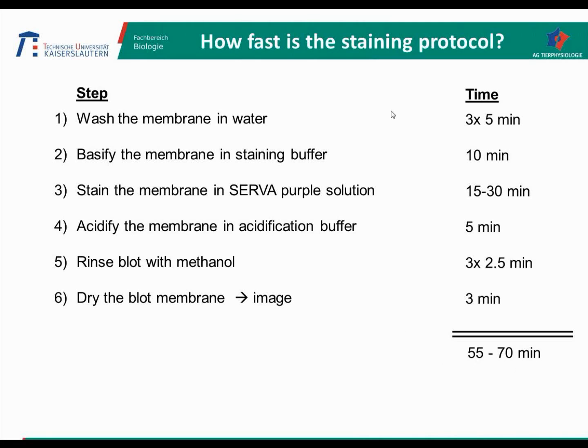So this is no disadvantage, because when you use immunostainings with housekeeping proteins, then you know that in the traditional variant, the primary antibody incubation alone lasts 2 hours. So this is no disadvantage.